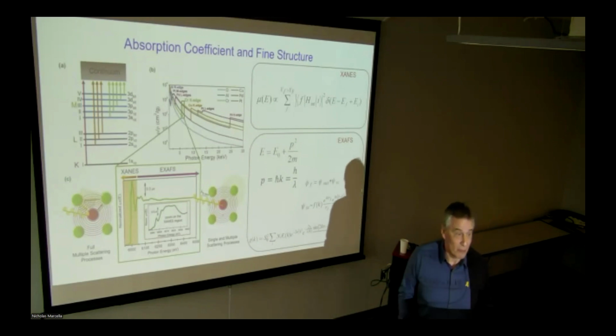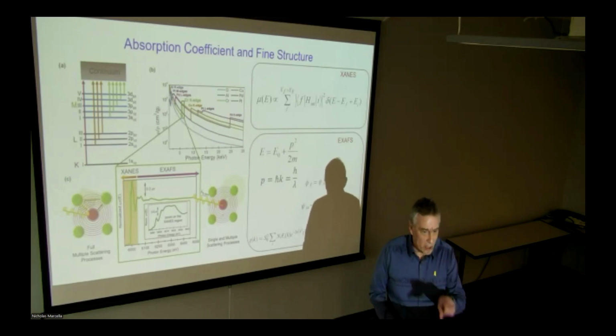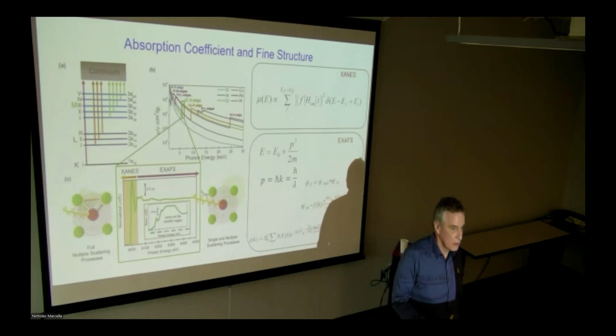Nobody really does it like that, because there is a much better way to understand the distance, to learn the distance, rather than looking at the maximum and minimum in the periodic function. And what would be the better way to do it? Who would suggest how else we can learn about the interatomic distance other than looking at the maximum and minimum of a sinusoidal function? In signal processing, we often use that.